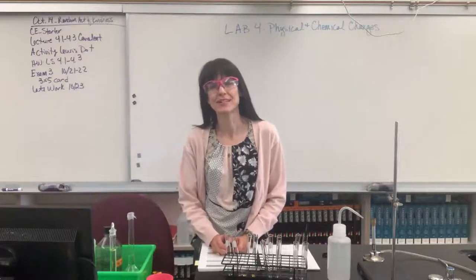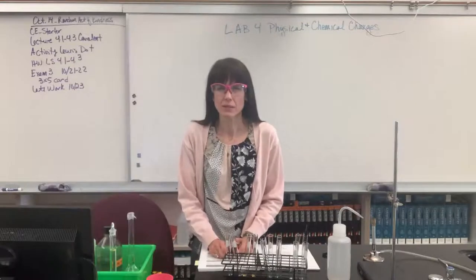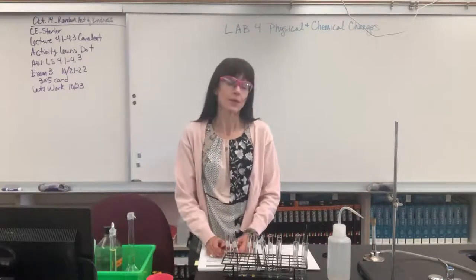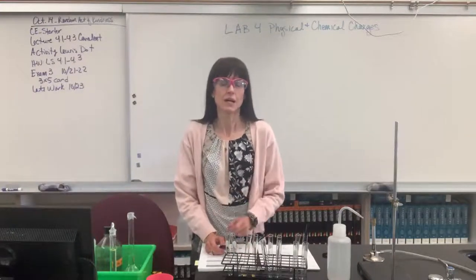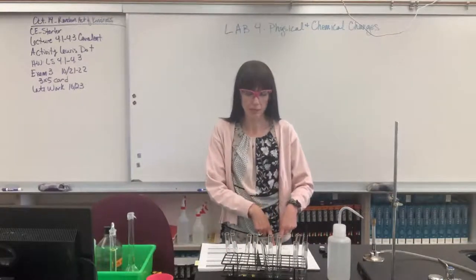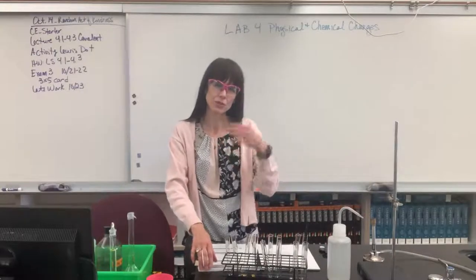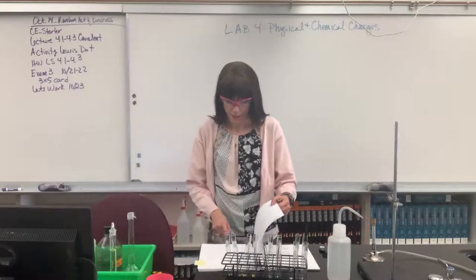Hi everybody, we are going to do lab number four, physical and chemical changes. I'm sorry that we don't get to do this together in class with our hybrid schedule, but next best thing, you're going to watch me do it and you're going to record the data while I do it. I am walking through procedures beginning on page 46 and I'd like you to follow along with me as if you're doing this experiment with me, and then you are going to record the data on page 53.